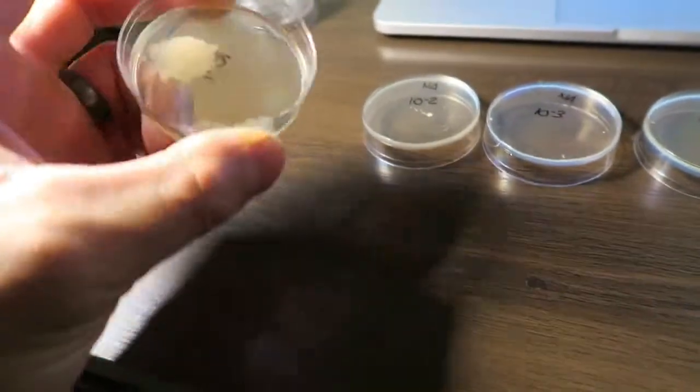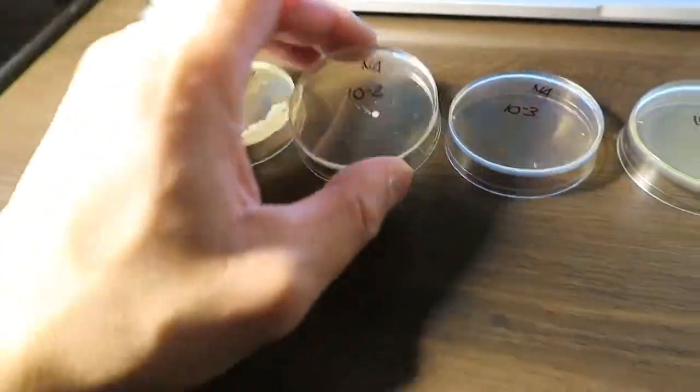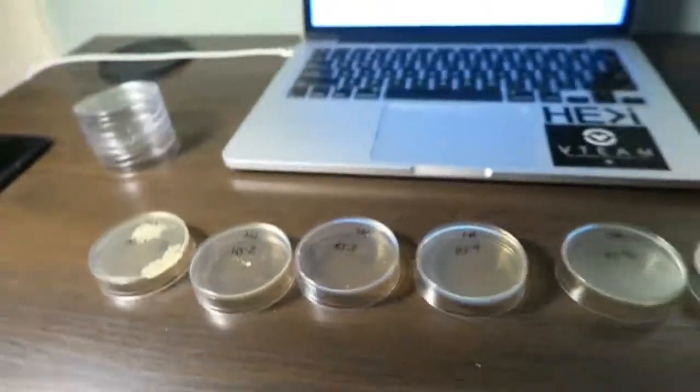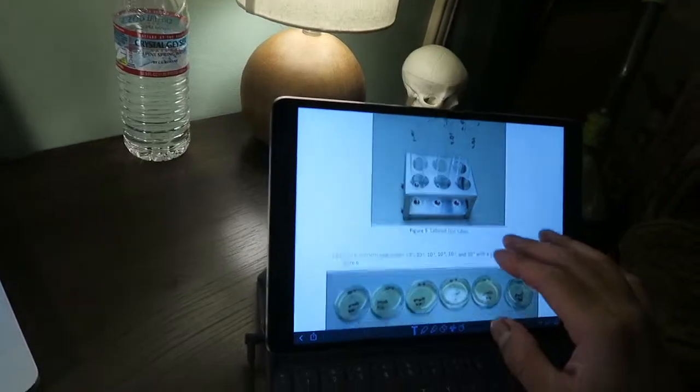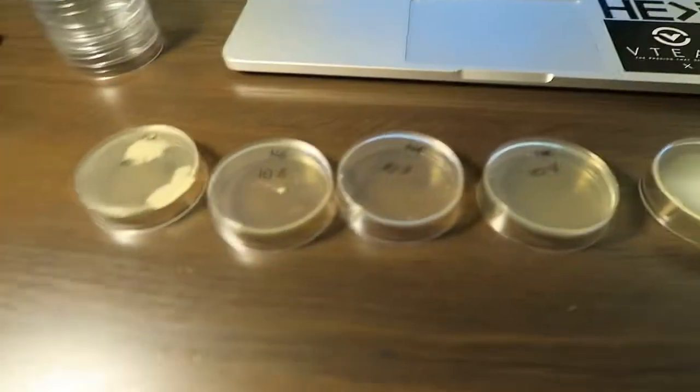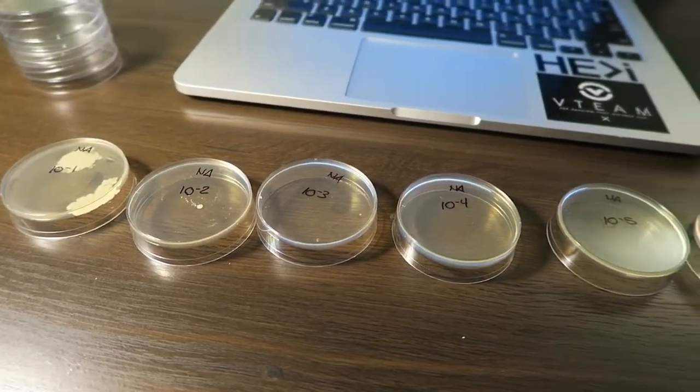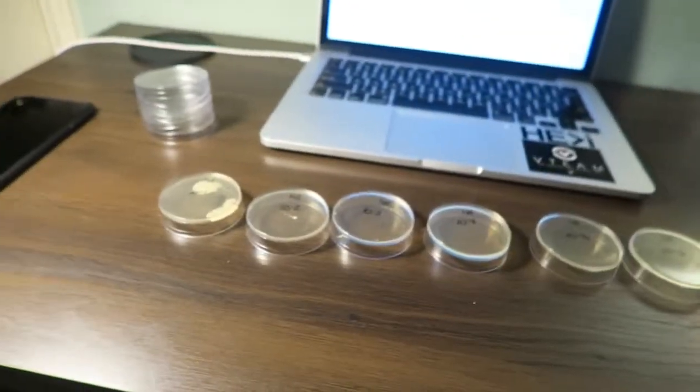So when I did pour them, I swirled them around so that it evenly goes over the agar on each of them. Even with the yeast, I let it soak for over 10 minutes. I put distilled water. So I don't know what happened. I'm thinking the dilution process of switching from the pipettes to each test tube—that's where I think it might have gone wrong.